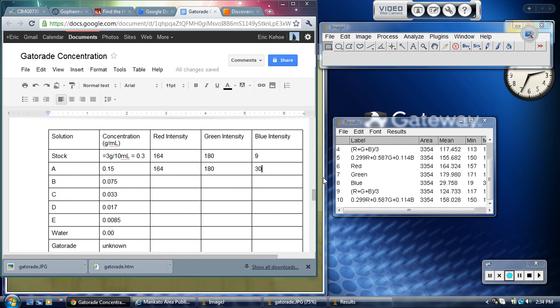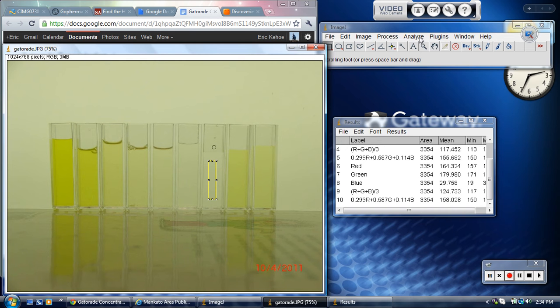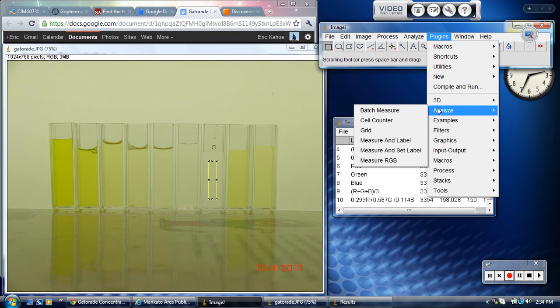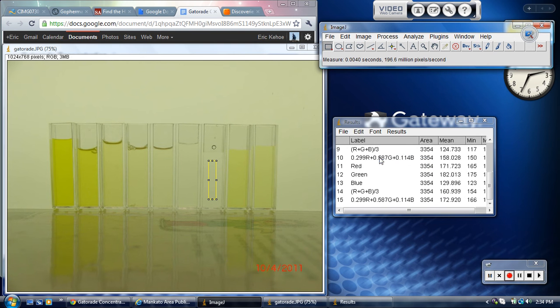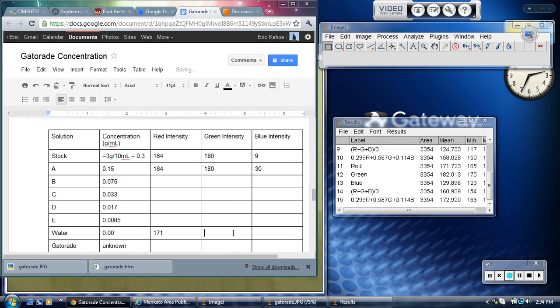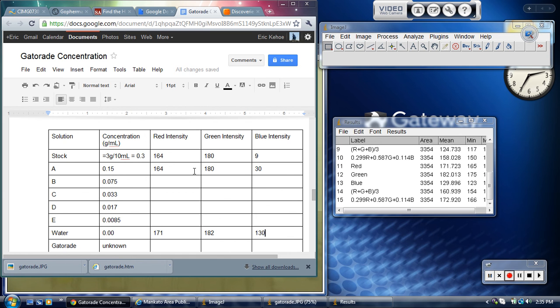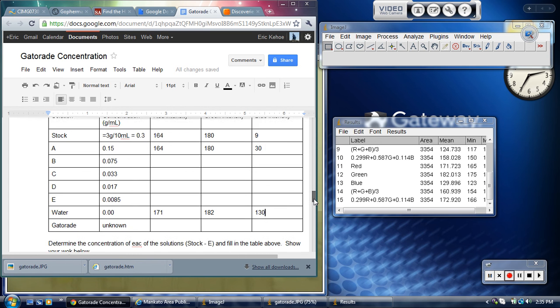I'm going to skip over to my water now. So you'll be doing the rest, of course, I just for purposes of showing you what it is you need to do, I'm just going to skip to the water. Again, go Plugins, Analyze, Measure RGB. And now I see for my water, my red is 171. You know it's letting a little bit more red through because that number is higher. My green is 182, and the blue is 130. Now water is the least yellow thing I have, so that's the highest the blue intensity is going to get. Now you're going to do the same thing for all your rest of your samples and for your Gatorade, and then you have to do something with those numbers.